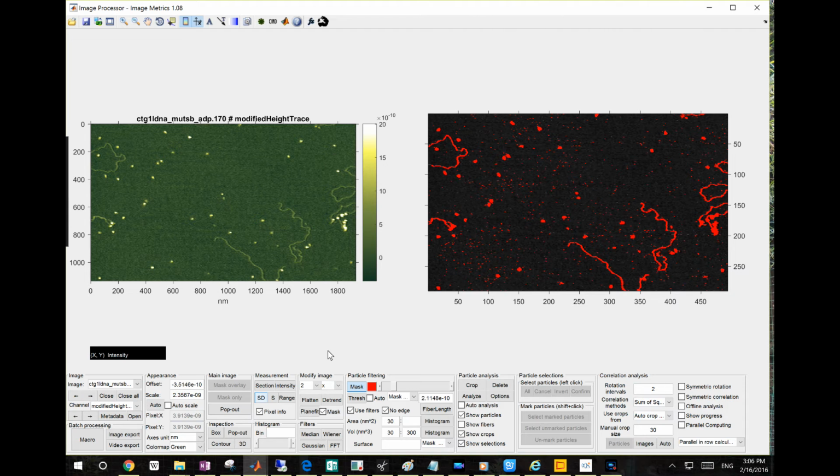Use first order to correct linear trend, second order to correct nonlinear trend, and third order to correct even higher order nonlinear trend. But sometimes you probably want to use plane fit, which fits the whole surface to a polynomial surface. You can fit a linear surface, or a high order nonlinear surface.